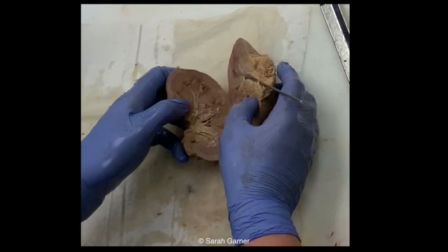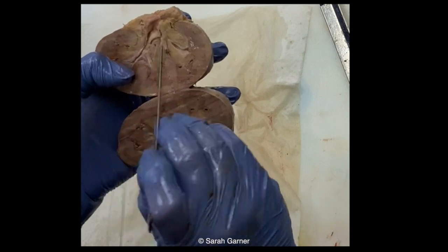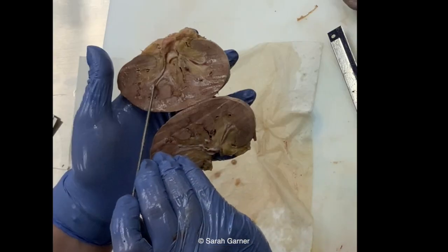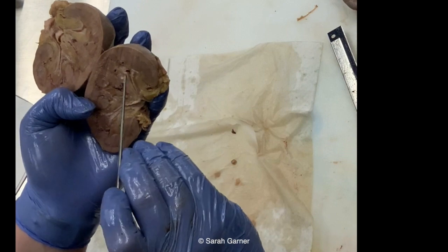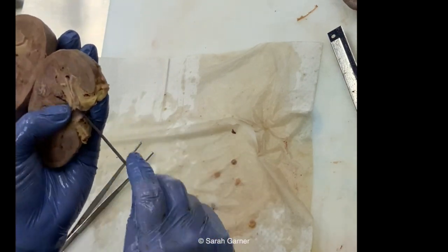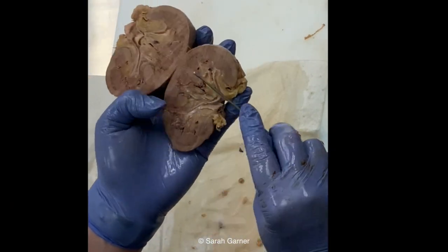And look at that cut. So now you're inside the renal pelvis. You can see the calyceal system here. So this would be minor calyx, major calyx. Same thing over here. Minor, major. So if you want to, you can then go ahead and open up the rest of this and inspect the full calyceal system.